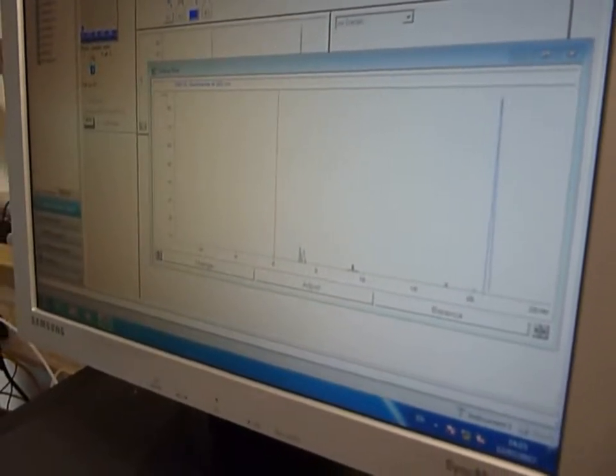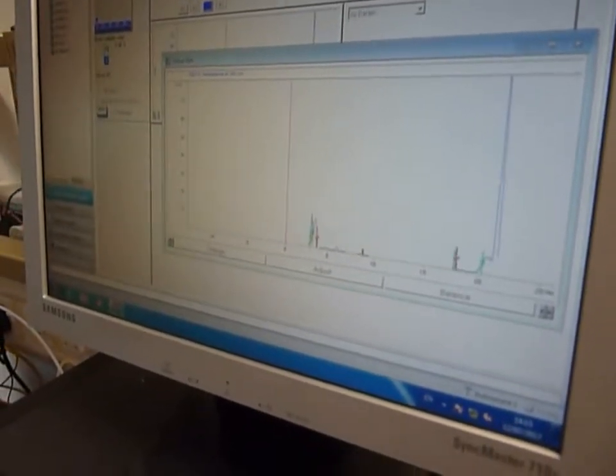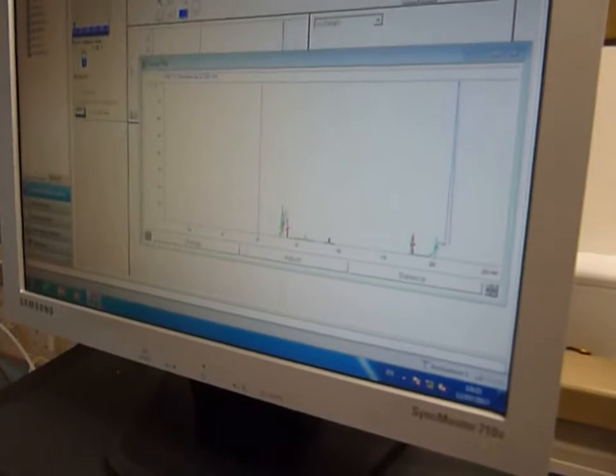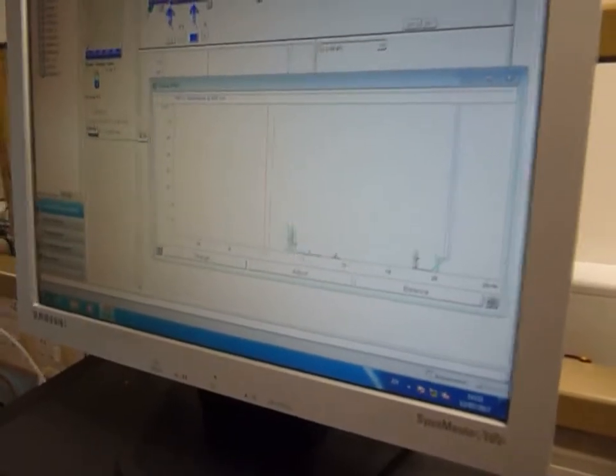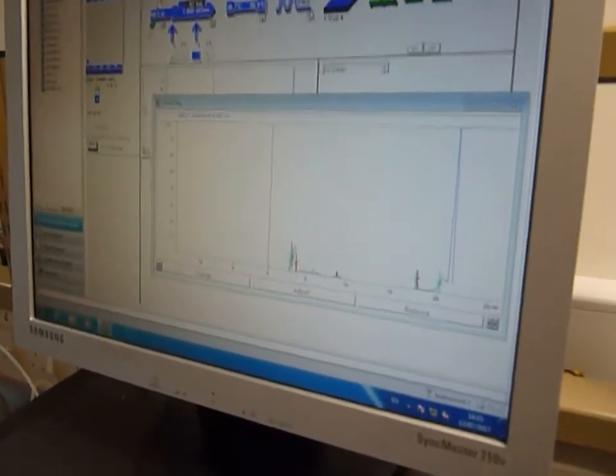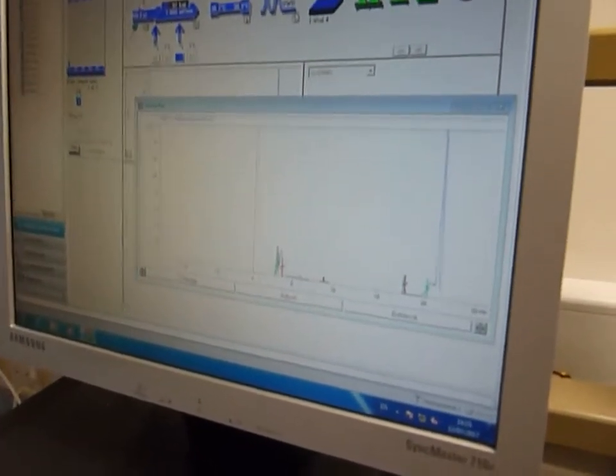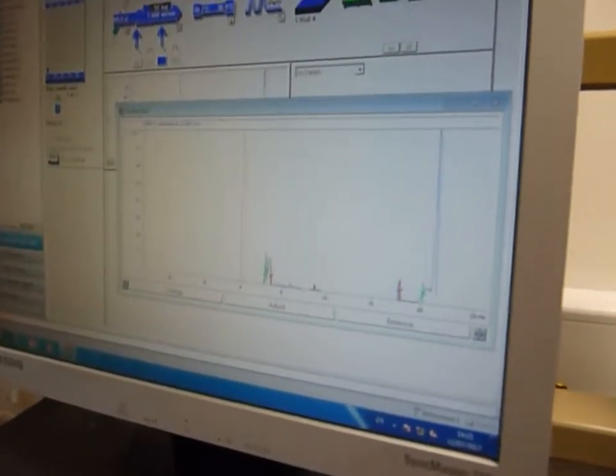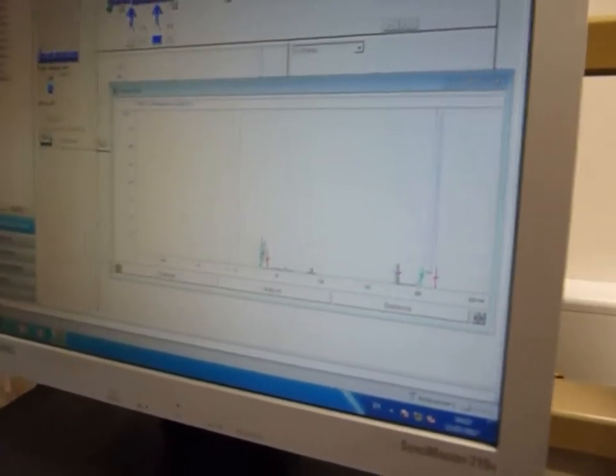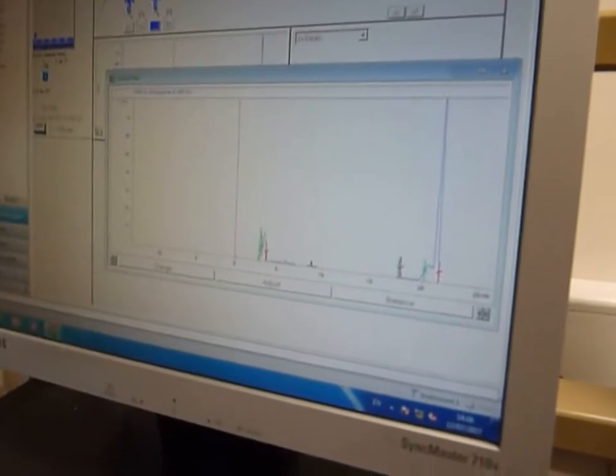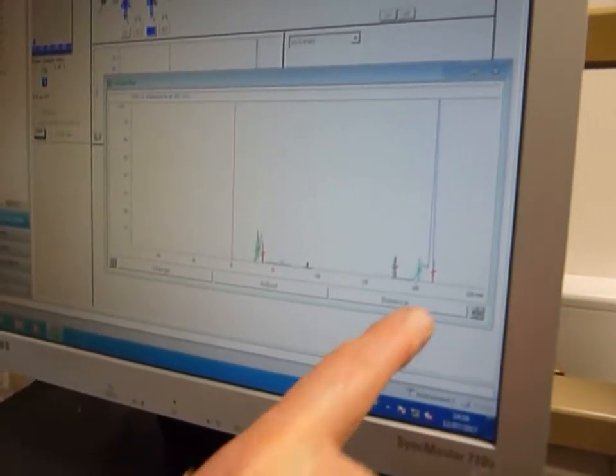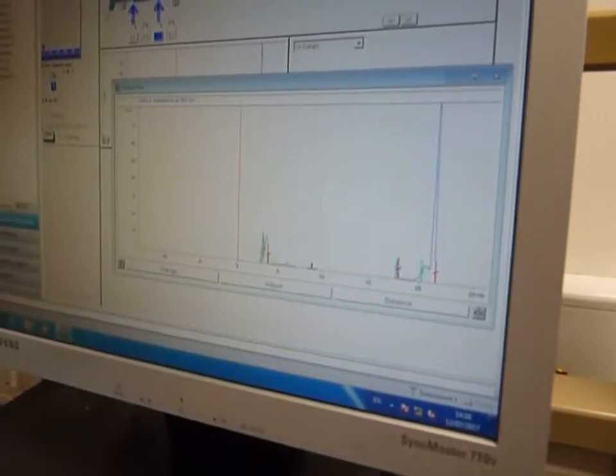I've got it actually collecting on the actual UV absorption, once it crosses a certain threshold. I think I've got it set at 5, so that's the end of the fraction collection there. Sometimes you can set it where you can get a little tighter fraction collection if that's what you want.